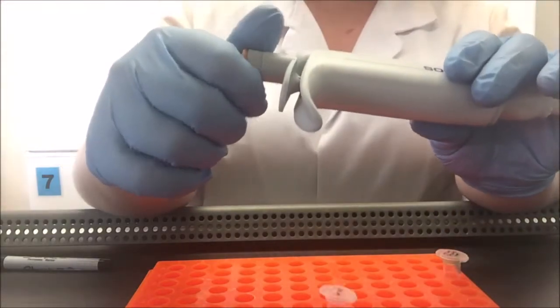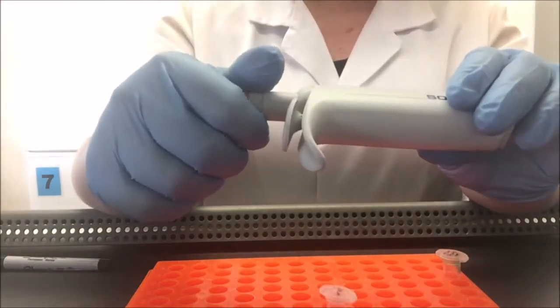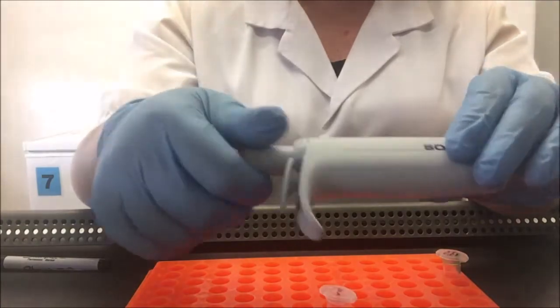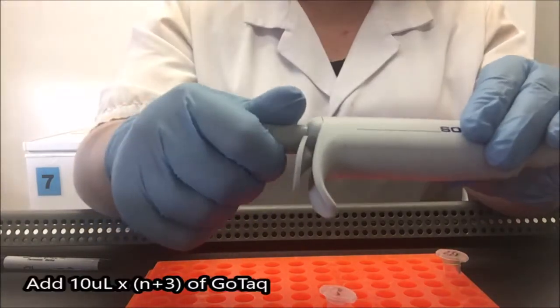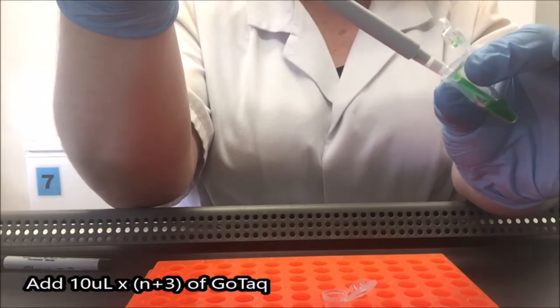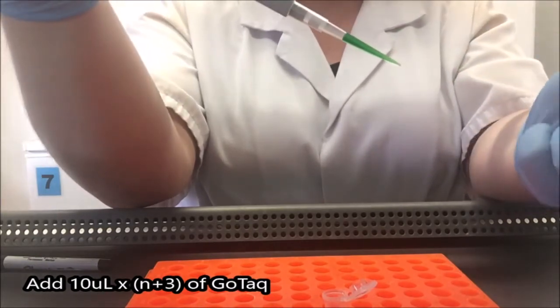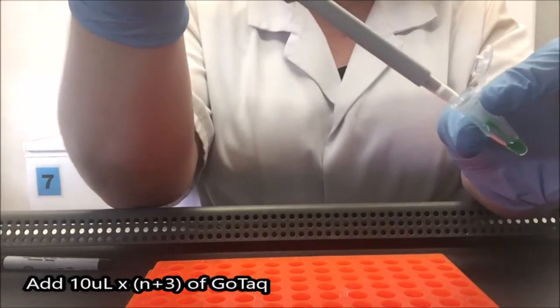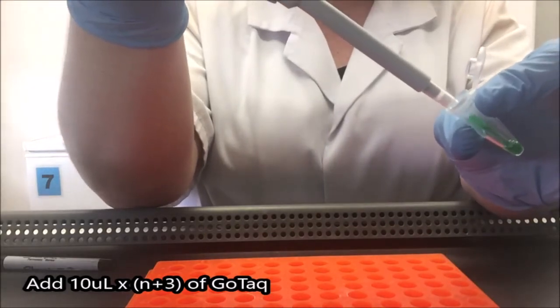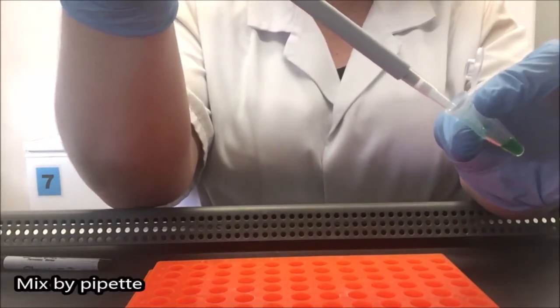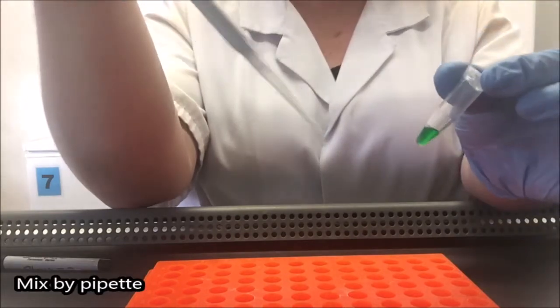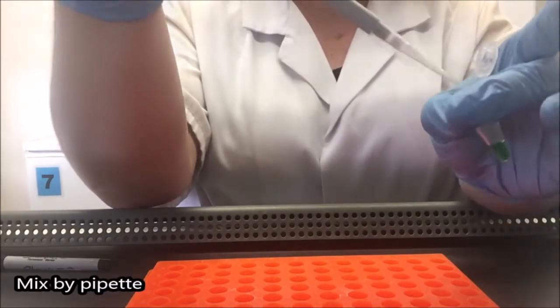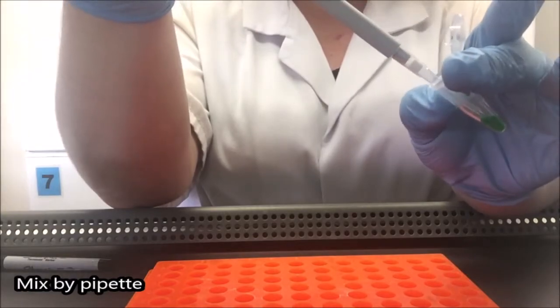Finally, I need 10 microliters for every sample, so 90 microliters total of my GOTAC. I'm adding this last because it's the most expensive reagent. And I want to make sure that if I make a mistake and have to start again, it's before I've committed a large amount of the most expensive product. There we go. You saw there I mixed by pipette, just up and down gently with pipette.